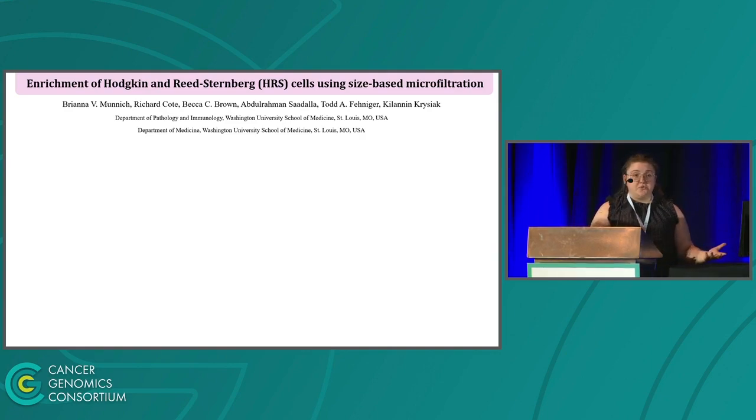I'm very excited to talk to you about the novel method our group developed to enrich for Hodgkin and Reed-Sternberg cells using size-based microfiltration.